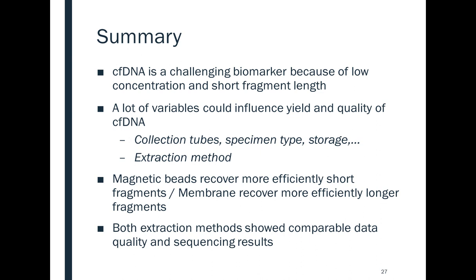Thank you. Can you explain the difference in estimation of cfDNA concentration, overestimation of QIAamp, and absence of difference in sensitivity? The overestimation coming from the QIAGEN kit, I would explain by the usage of carrier tRNA used in the QIAGEN workflow. This is a double-stranded RNA, and the dye of the Qubit may intercalate to the double-stranded portions. So this is why it's maybe overestimated. And we are not finished with our establishing process or validation process. So I could not really say why there's no difference in sensitivity.